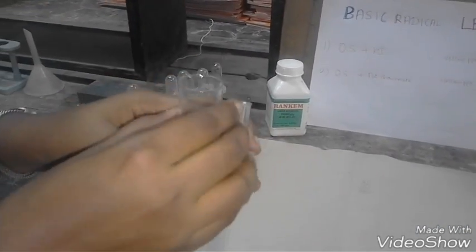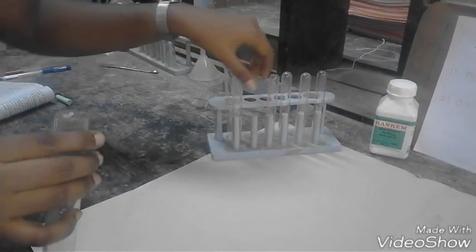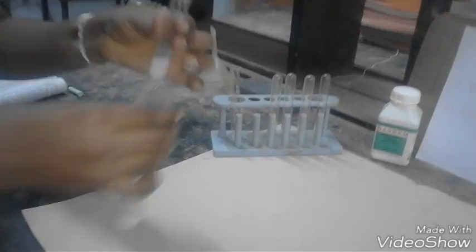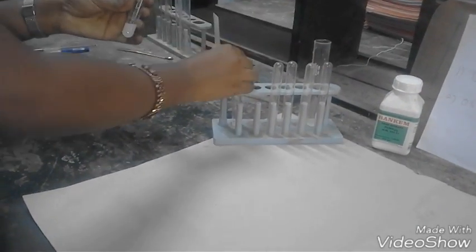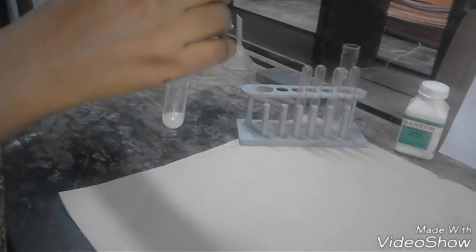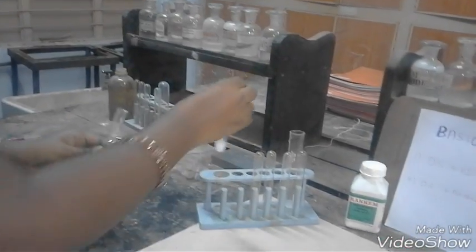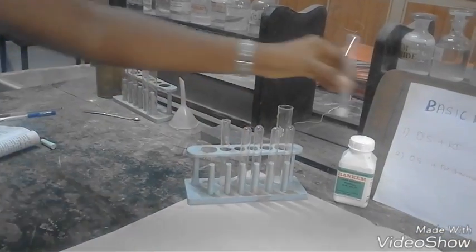Take the test tube now. Here I am going to do two confirmatory tests. The original solution is divided into two test tubes equally, but not more than half of the test tube.